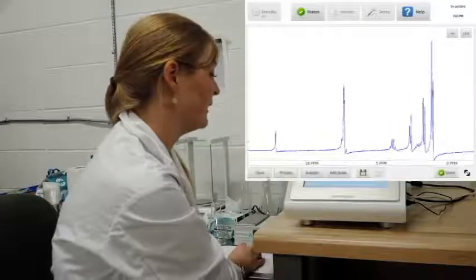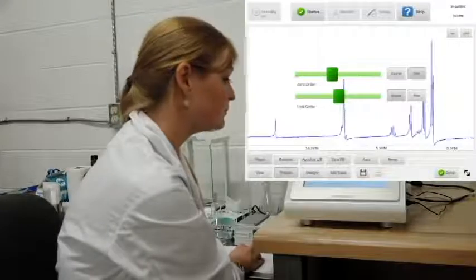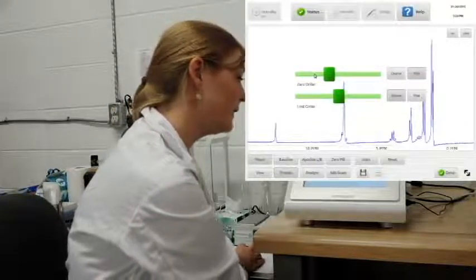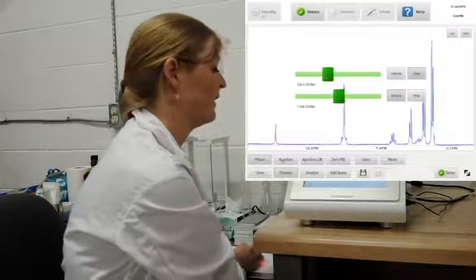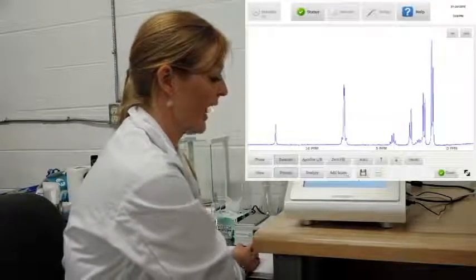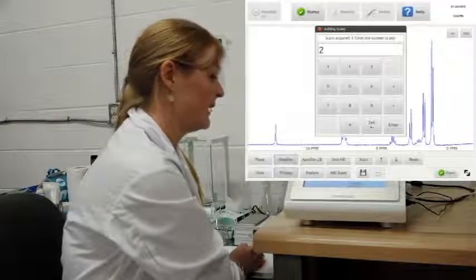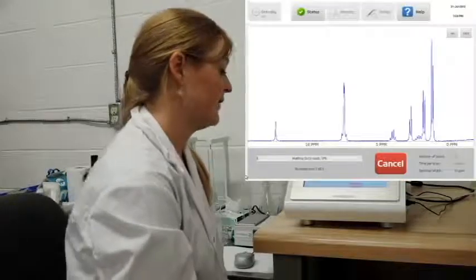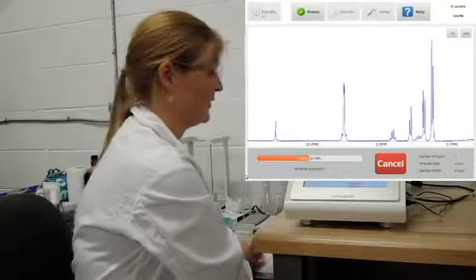Okay, so I'm going to go in and phase it a little bit on a fine adjustment. So a few clicks here in the green gives me a nice phase, and then I can baseline correct it. So the signal to noise here is pretty good, but I just want to show you this additional feature where you can add more scans. If I click on the button, say I want to run 2 more scans, you can do that very simply, and you'll see a little bit of improvement in the signal to noise ratio.